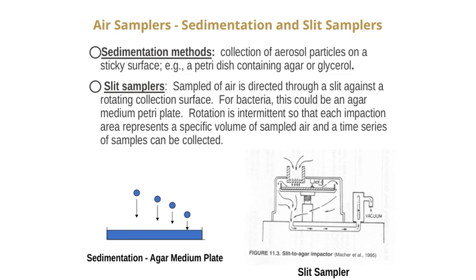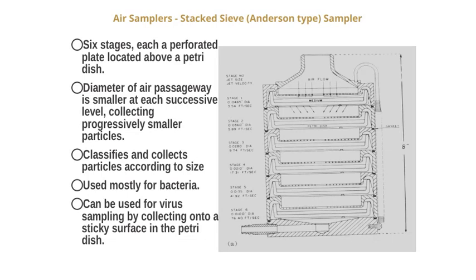Both techniques are vital tools in understanding airborne particles and microorganisms, tying into our overall goal of monitoring and analyzing air quality and microbial presence. Now, let's take a closer look at the air samplers, specifically the stacked sieve or Anderson-type sampler.